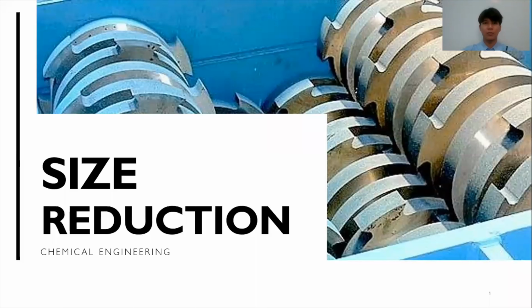About the objective: to grind the hard sugar down into smaller sizes by using the ball mill, and to obtain the particle size distribution of the initial and the final sugar mixture. Ball milling is a method used to break solids down to a smaller size or into powder. A ball mill is a type of grinder which consists of a cylinder. It is used for grinding material like ore, chemicals, semi-raw material, and paint.